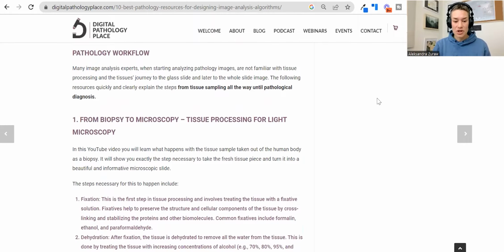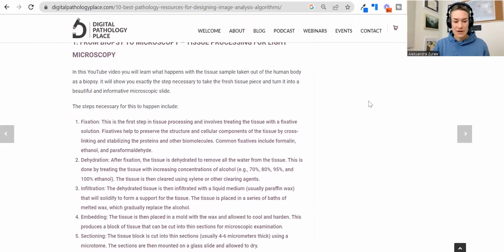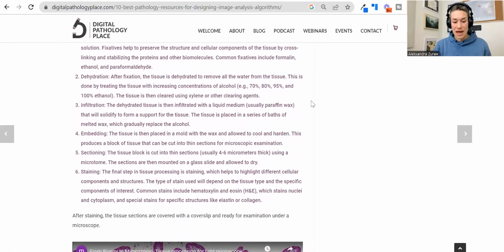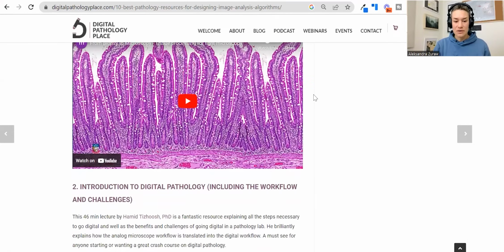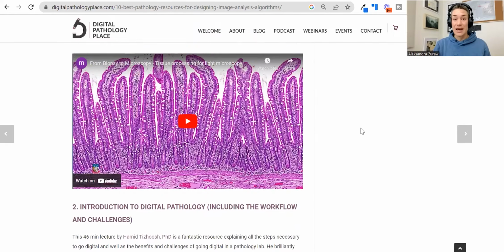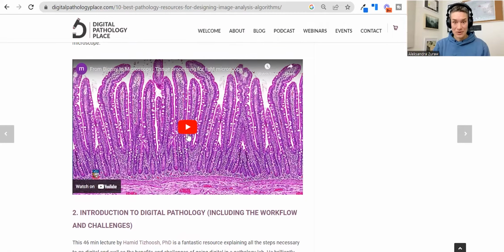So, pathology workflow. There is a video that is going to take you through all the steps: fixation, dehydration, infiltration, embedding, sectioning, and staining. All those videos are embedded here, so I have found them for you. And actually, I have identified gaps on YouTube, so I'm going to be making more videos for you about this. For example, this one is going to walk you through the whole process.